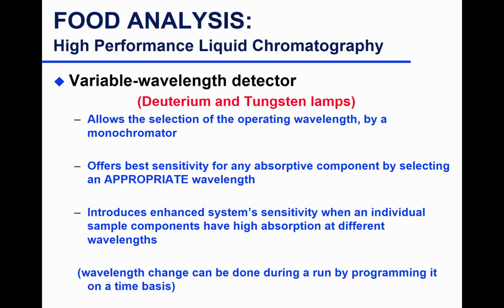We always select for the wavelength that gives you the maximum. Not always, I want to say, mostly, because in some cases you have to deviate to avoid interference. But in most cases, we select the wavelength that gives you the highest absorbance, because that would give you the optimal sensitivity and differentiation between two closely related concentrations. So that's that.